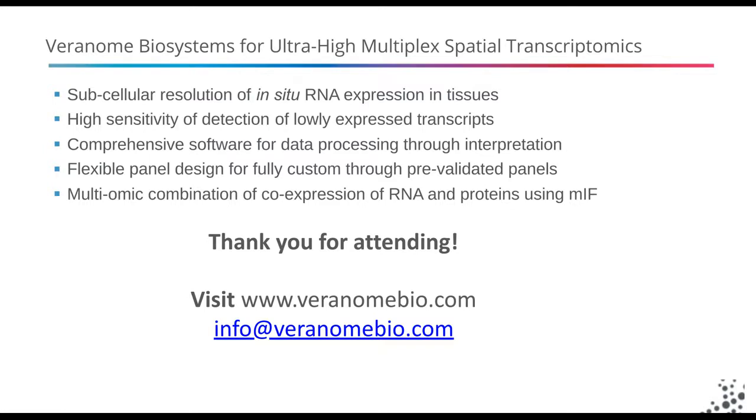Yeah, again, this is being used pretty well as a discovery tool, and we've been able to detect novel signatures across other brain regions. We're looking at really interesting results in subregions of the cortex, the hindbrain, and thalamus, where we're seeing really novel patterns and expression signatures. And the data suggests potentially new cellular subclasses or at least novel functional states that are unique. And since we have both quantitative differences in expression and spatial patterns, we don't necessarily have to rely solely on the numbers like you would in a single cell sequencing type experiment.